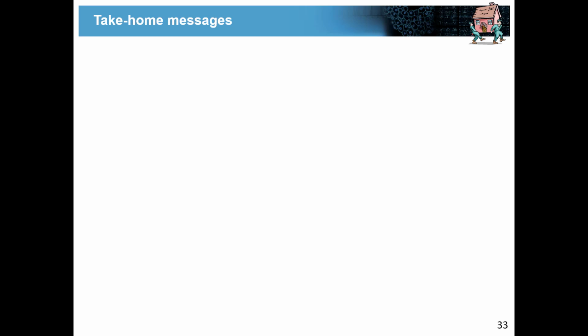Yeah? So if I generated some data from SRM... So you mean that you will get slightly different retention times if you have acquired the data on different instruments and different setups? Yeah, absolutely. If you apply a 60-minute gradient for both, you can easily see shifts of 5, 7, 10 minutes between LC setups, because it's a different setup, so that's not surprising at all. Also, that you maybe see a different fragmentation pattern is possible, because it's a different collision cell in the two instruments.